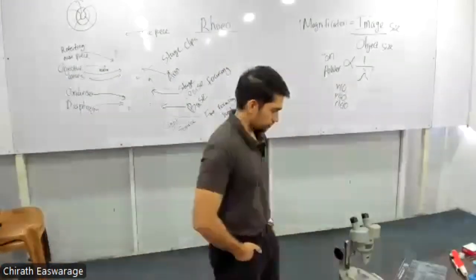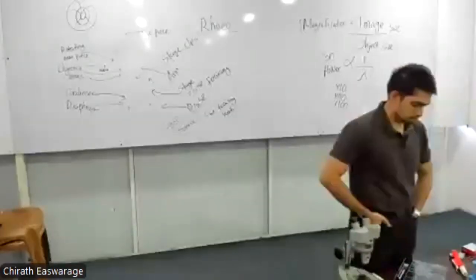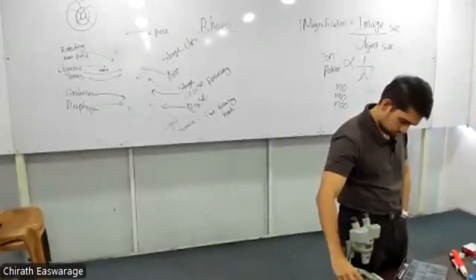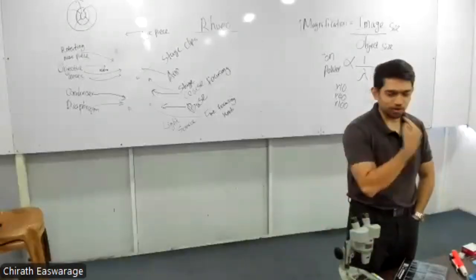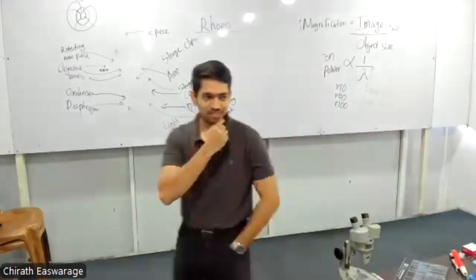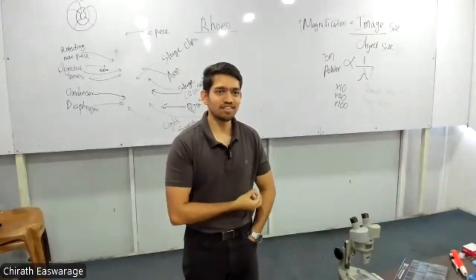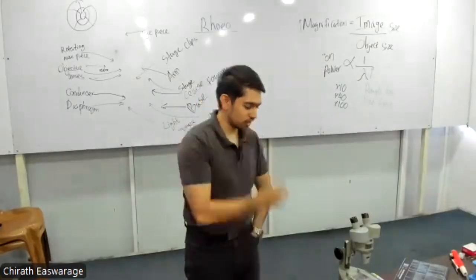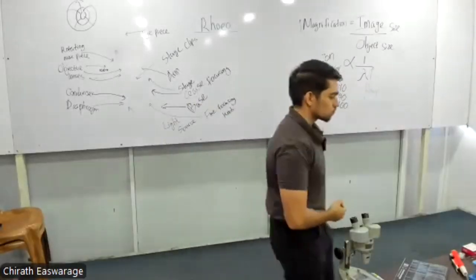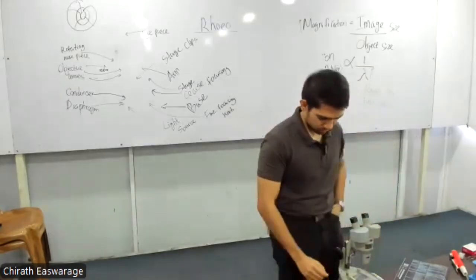Right. So what we can do next is you can take turns and come and observe. Let's try to prepare an onion peel. Anyone who's willing to donate their buccal lining, cheek epithelial cells, that's part of the practical. Using a yogurt spoon, we can scrape and put it on a drop of water. Then we can observe, right? For now, let's try to observe this.